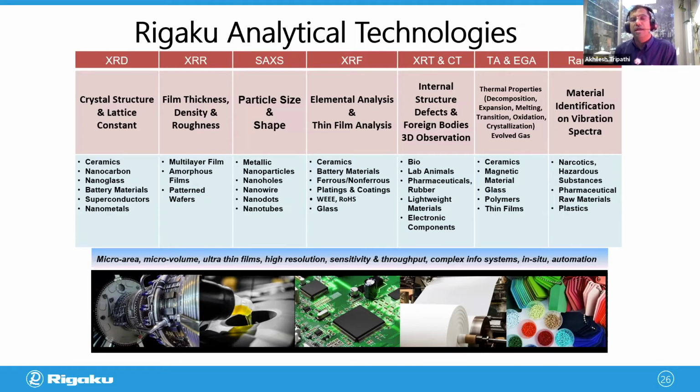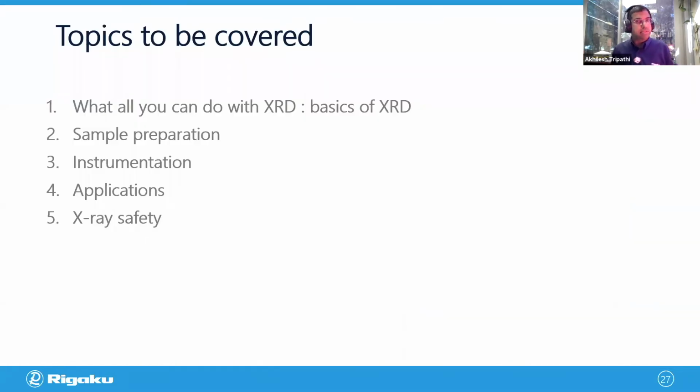And then we have other areas, XRT, TA, and Raman. But let's see today in this talk a little detailed study of XRD. So I decided to divide this talk into 5 parts. What all can you do with XRD? A little bit basics of XRD.